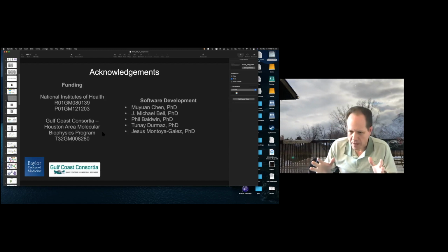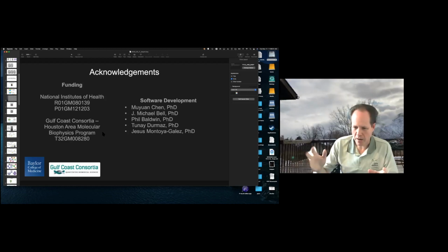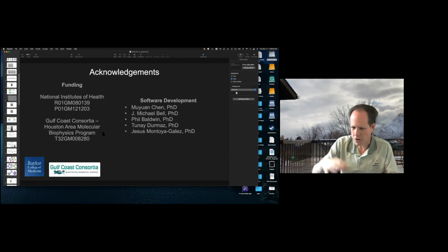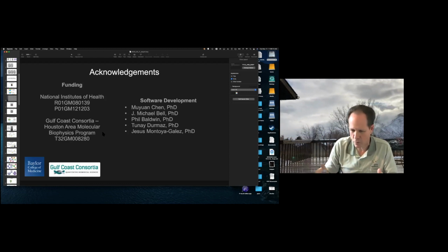There's a big difference between the Gaussian representation and the resolution that you can get, right? The number of Gaussians that you're using is limiting the level of detail at which you can represent the motions. Say you had a single alpha helix waving around in space. If you generated your Gaussians at 20 angstrom resolution, then you probably just wouldn't have a Gaussian occupying that feature in a way that you could resolve it.